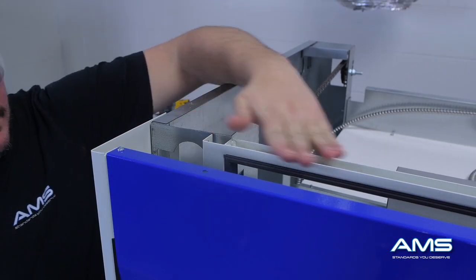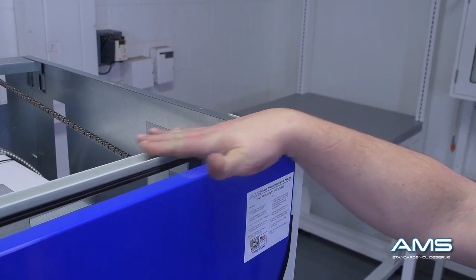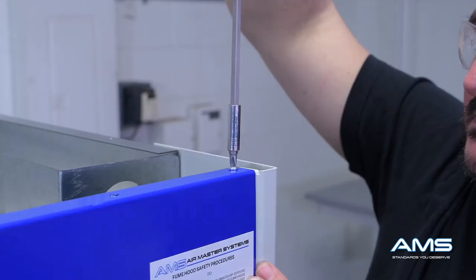To do so, align the sash with the frame on the inside. As you can see here, both sides are level to the frame and flush, which means the sash is still in great condition.